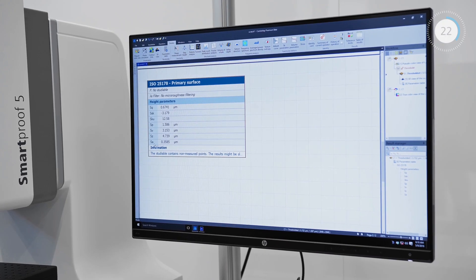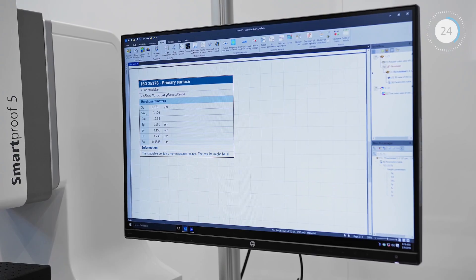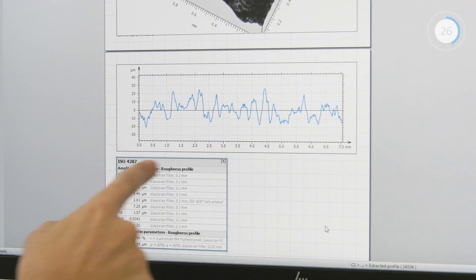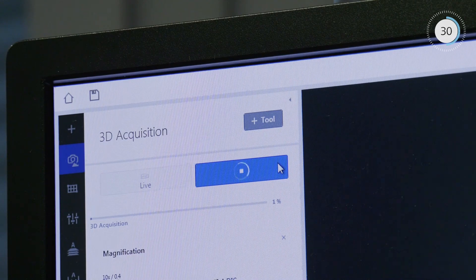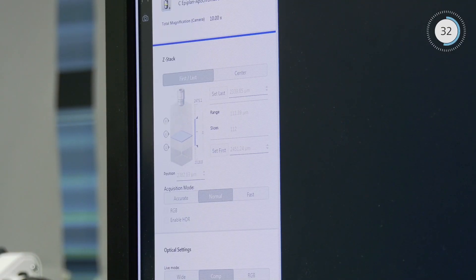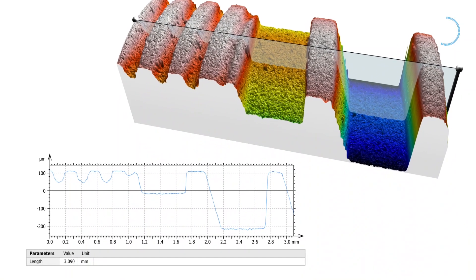Analyze surface roughness optically, without contacting or damaging the sample surface. Aperture correlation technology yields both high optical resolution and fast acquisition speed.